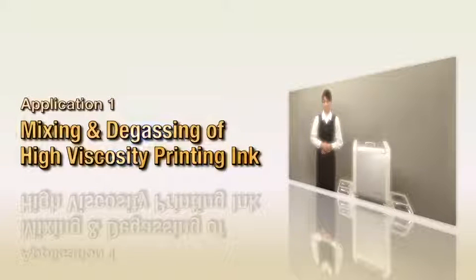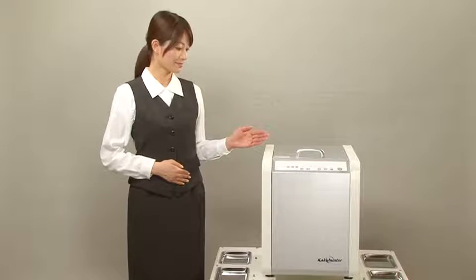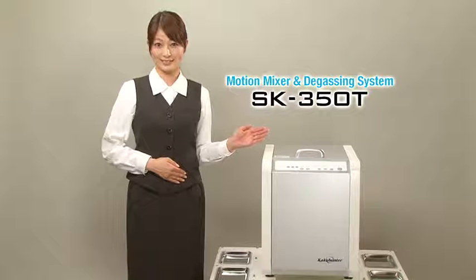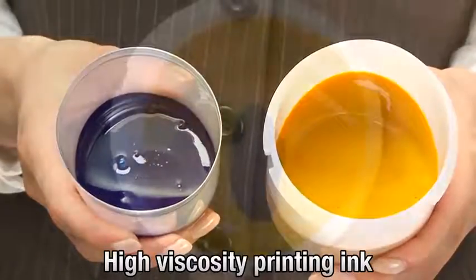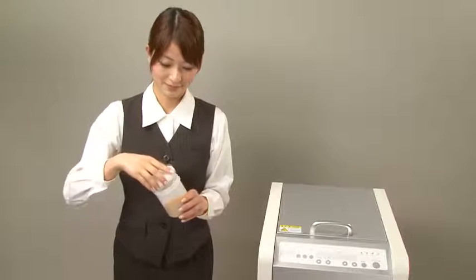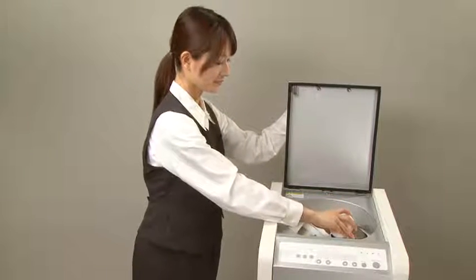Mixing and degassing high viscosity printing ink. We will now mix and degass a high viscosity paste using the SK350T. First, we prepare the materials — we will be using high viscosity printing inks. The container with the materials is set in the holder and the lid is closed.